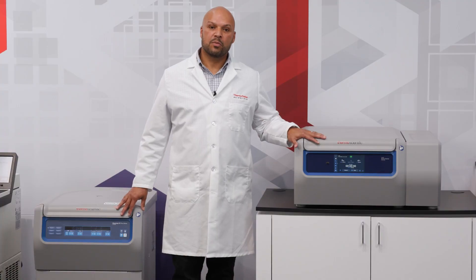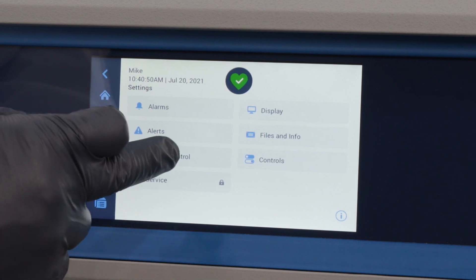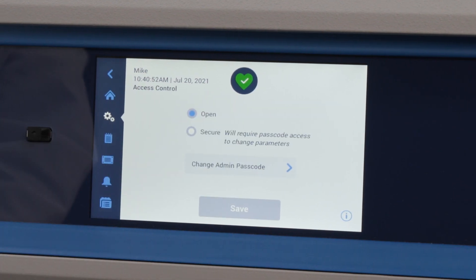Both units as they come will be open access, which means anyone can program or run them. On the X4 there is a feature where you can password protect it and enable the secure mode.